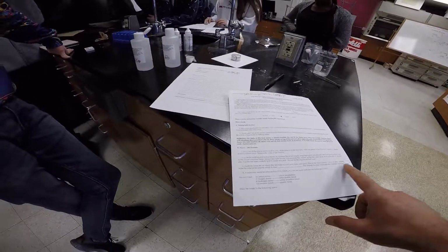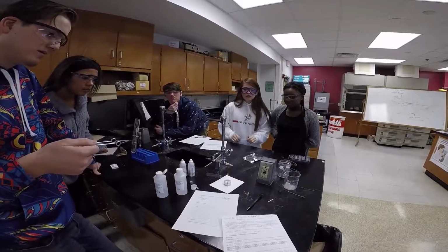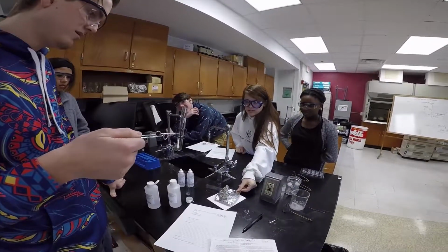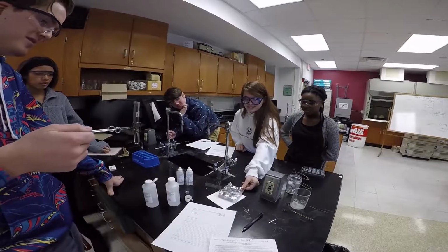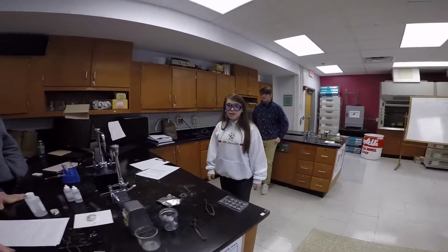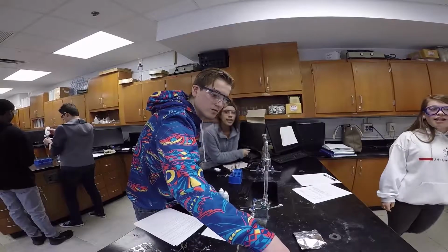Yeah, you're trying to find ethyl acetate. Seneca, what's happening? You can go ahead and cover it so you have more to use in a few minutes. What is that? No, it's not out, the stick. So what does it smell like, Eliza? It said pear drops. Did you smell the pear drops? No, it smelled like nail polish.